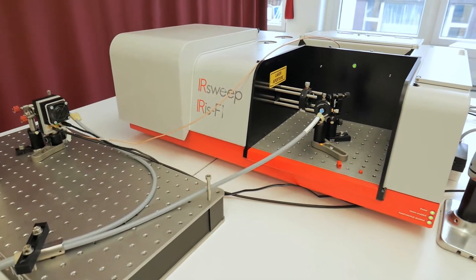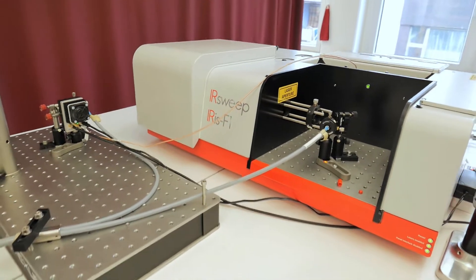So welcome to IR Sweep. We have a short video today showing you a fiber measurement.